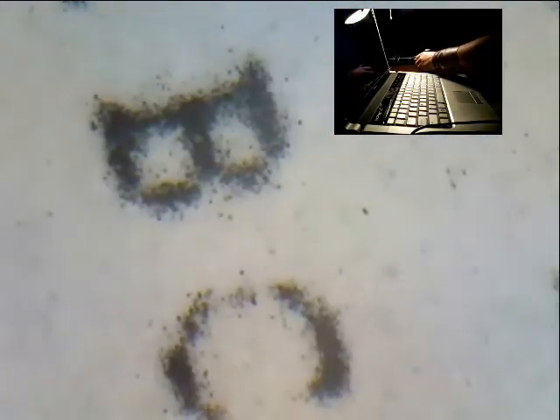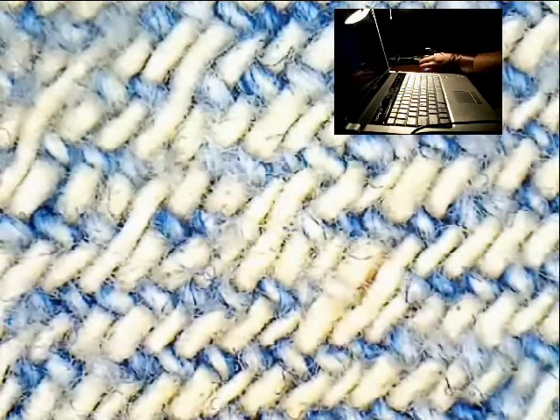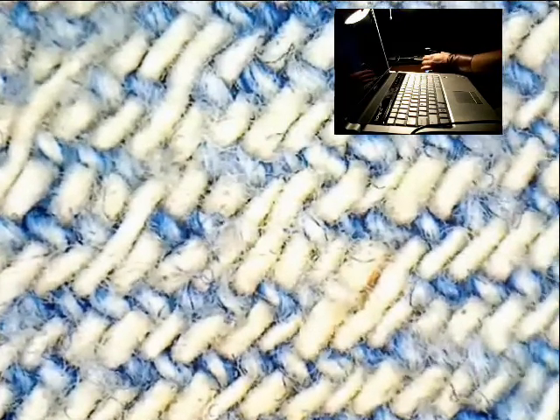I'm going to set this aside. I've got a number of things I'm going to show you. This is a piece of denim that I cut out of some jeans. I'm going to bring this back to the low setting and set this just on top. Here's focus on the low setting. And here's me zooming in. Here's focus on the high setting, and you can see all the little threads that make up the denim that I've got here.